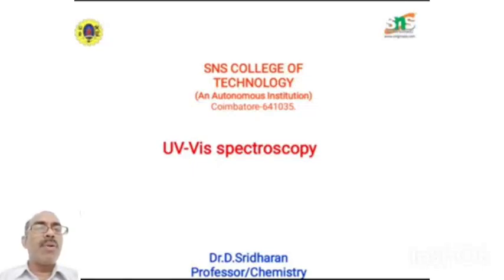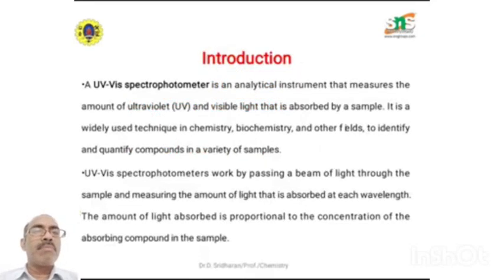In this video, we are going to see about the UV visible spectroscopy for the analysis of organic and inorganic chemical samples. Introductions about UV visible spectroscopy.